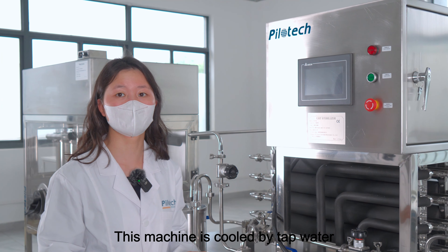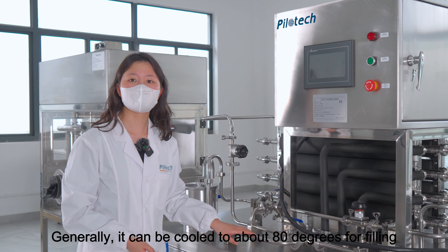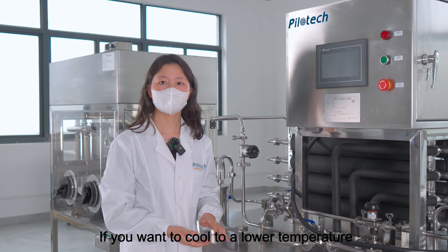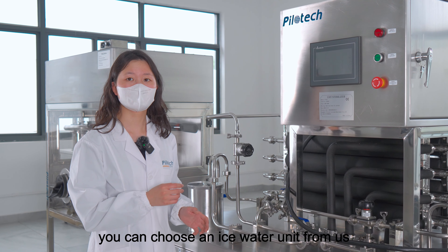This machine is cooled by tap water. Generally, it can be cooled to about 80 degrees for filling. If you want to cool to a lower temperature, you can choose an ice water unit from us.